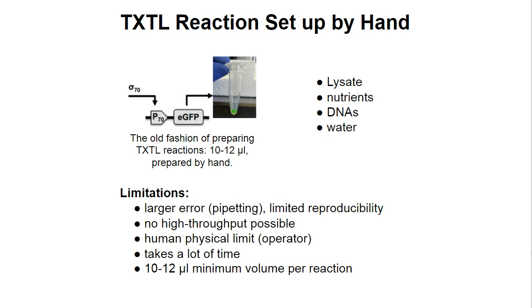And at the end of the day, for each reaction, we have to use 10 to 12 microliters of TXTL to acquire just one data point.